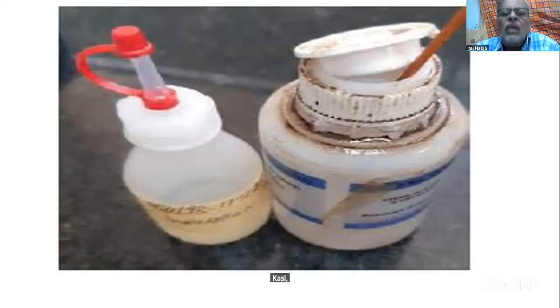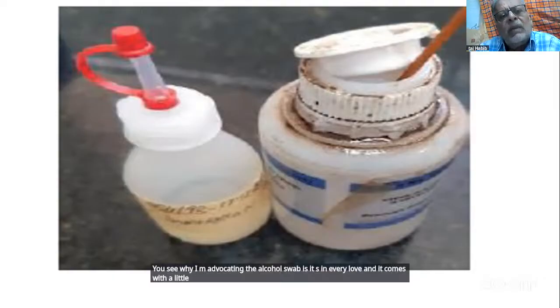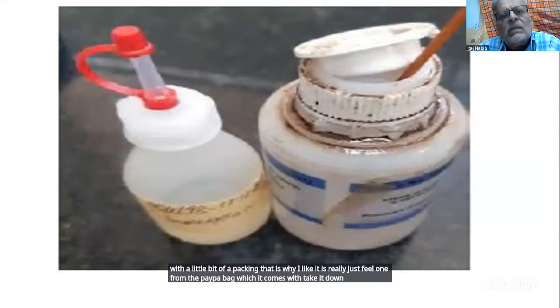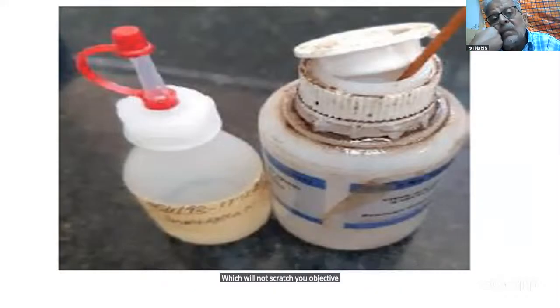You see why I'm advocating the alcohol swab: it's in every lab and it comes with a little bit of padding. That is why I like it. It's ready. Just peel one from the paper bag which it comes with, take it out and use it. So it's a double thing. It's got the alcohol and it's got a pad on it, which will not scratch your objective. Next.